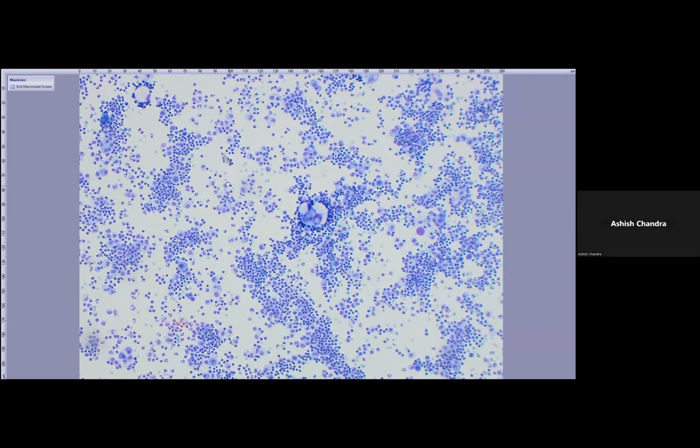Okay, so Danijela, you are ready? Yes, I will now share my screen. I hope it will work. Do you see it? Yes, we see, wonderful. So you are now seeing exactly what's on my microscope here. Lovely. Yes, sure.